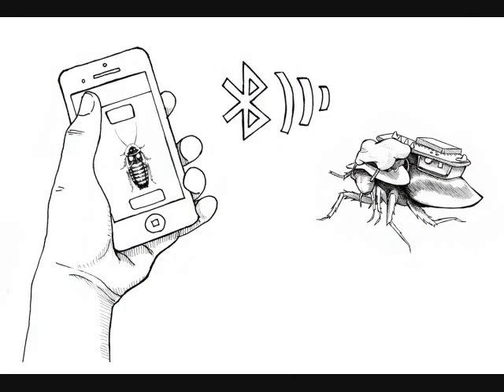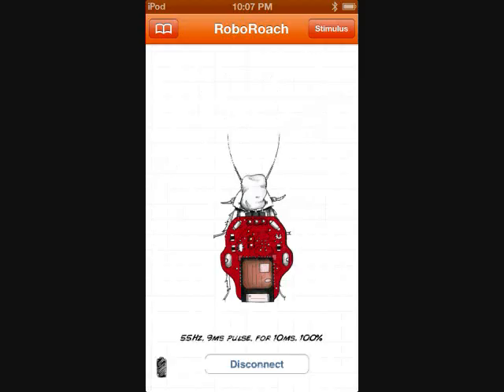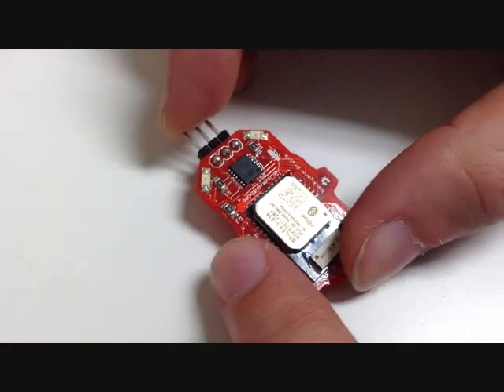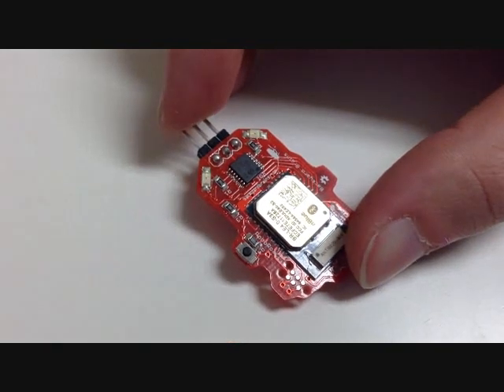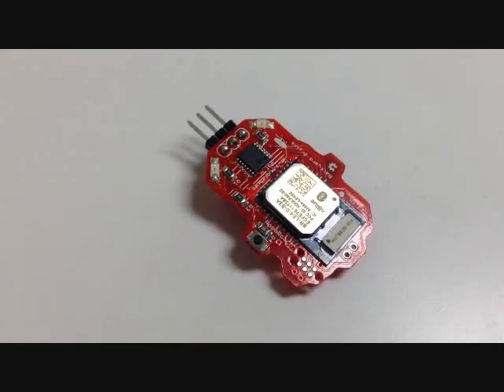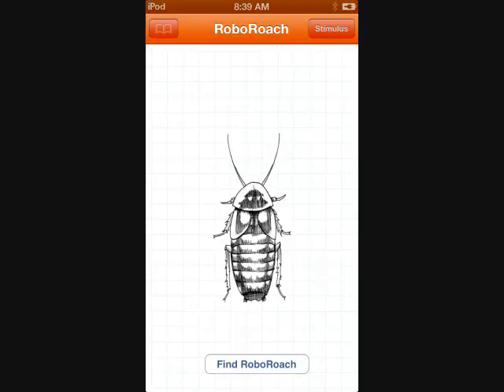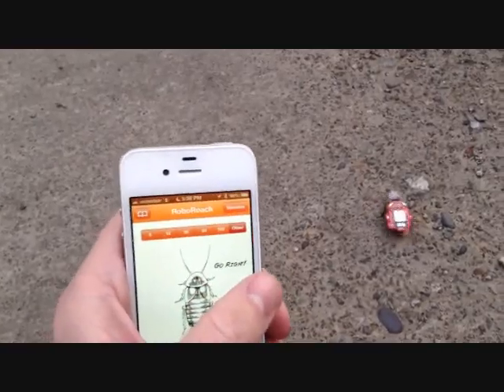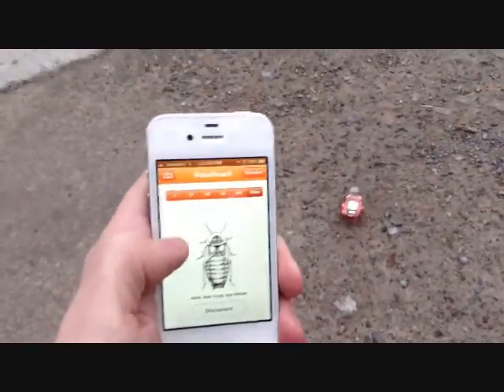The second exciting way to test your preparation is to stimulate the neurons in the cockroach's antenna and observe any behavioral responses. You can do this remotely from a Bluetooth low-energy compatible smartphone using the RoboRoach app. Once you have plugged in the male connector pins of the RoboRoach backpack into the female connector on the roach's head, press the small black button on the left edge of the printed circuit board. This will wake up the microcontroller for 30 seconds so that you can wirelessly connect with it. Open your RoboRoach app and click the Find RoboRoach button. Using the default stimulation settings, swipe either left or right on the screen and watch for any behavioral responses. If the cockroach turns towards the direction that you swiped, your surgery was successful. Good job — your RoboRoach is ready for the next experiments!